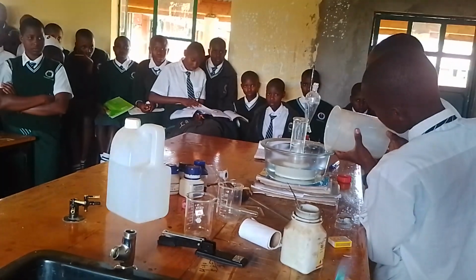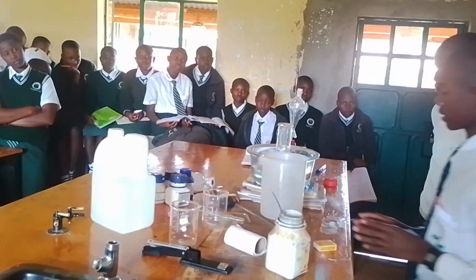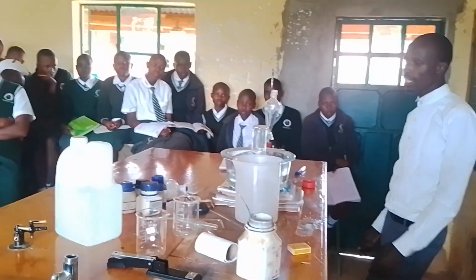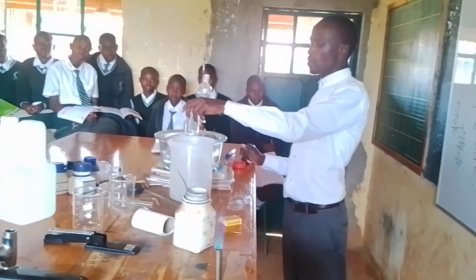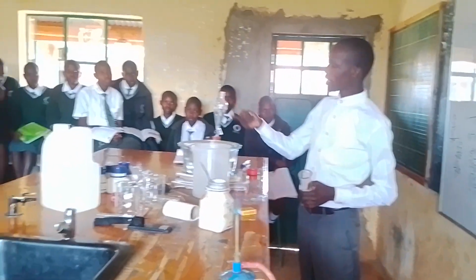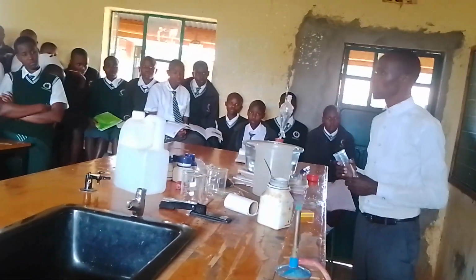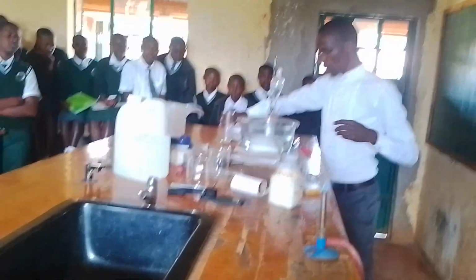That is fair enough. Now, wherever you are, I want you to be careful to watch the bubbles. When you see any bubbles coming, that shows that the gas is now moving. Is that okay? Yes. We will not begin by collecting the gas first because, of course, inside here there are traces of air. So we want to allow them to move out first before we collect our real oxygen.